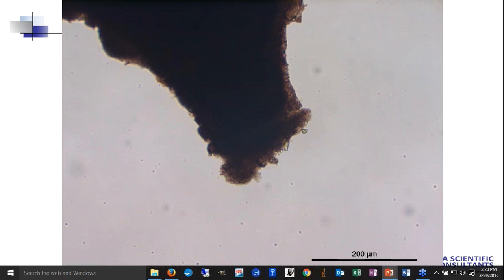We'll be looking at the blue particle next. This one, when they compress it, it rebounds. It's elastomeric. By polarized light with a single polarizer, it's fairly opaque. We can start to see some transparency on the edges. And if we look carefully, we see some black dots that look like they might be fillers or pigment.